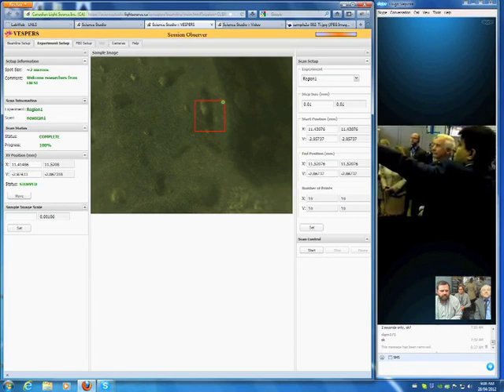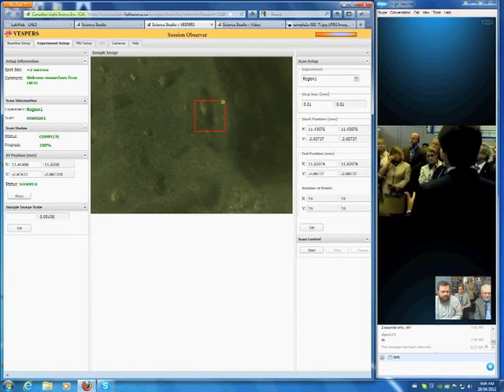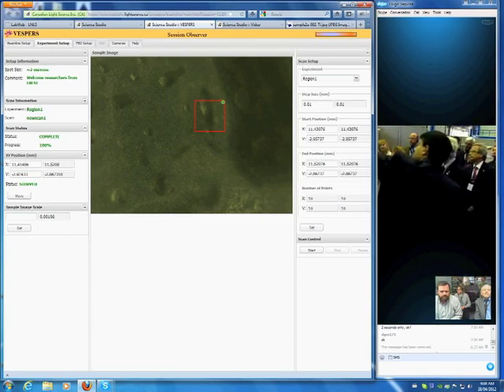This is a biological tissue. And the idea of the experiment there is that the concentration of titanium oxide seems to have a relation that we can see. So we're going to use X-ray fluorescence: basically, shine the sample with the beam. What you can see, the green dot is the beam, and the red square is the reading that we're going to see. We're going to have titanium oxide.